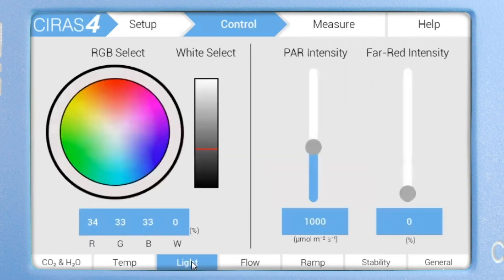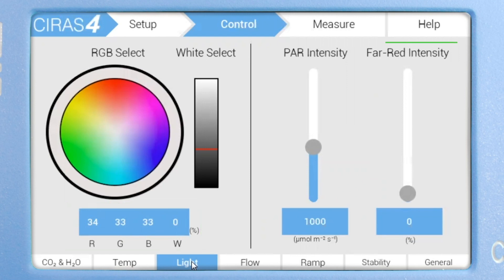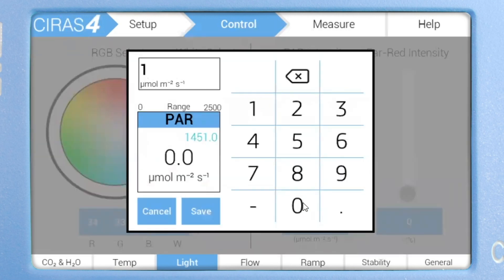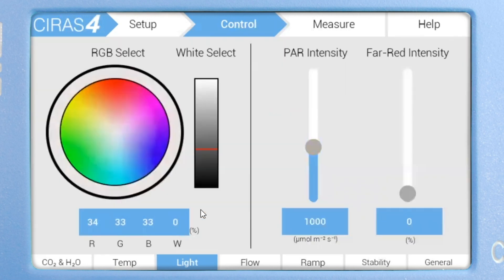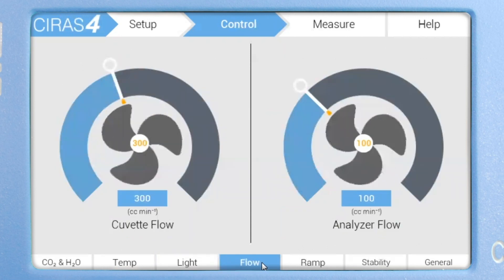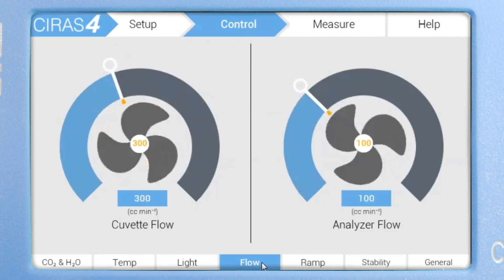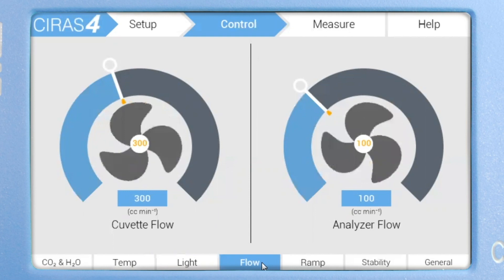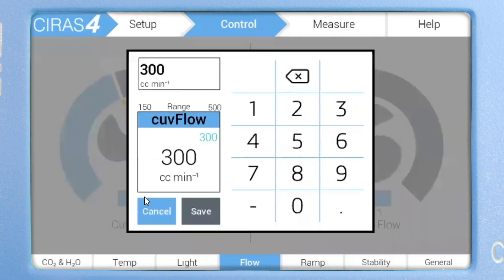Now on to light control. Here users can control RGBW settings, PAR, and far red light intensity. Let's keep everything as is with the exception of PAR light intensity. You can increase or decrease the light intensity using the slider or manually add a new value. Users can control both the cuvette and analyzer flow rates from one location. Flow rates can also be adjusted by using the sliders or by manually entering a value. Let's change the cuvette flow rate to 350 cc per minute.